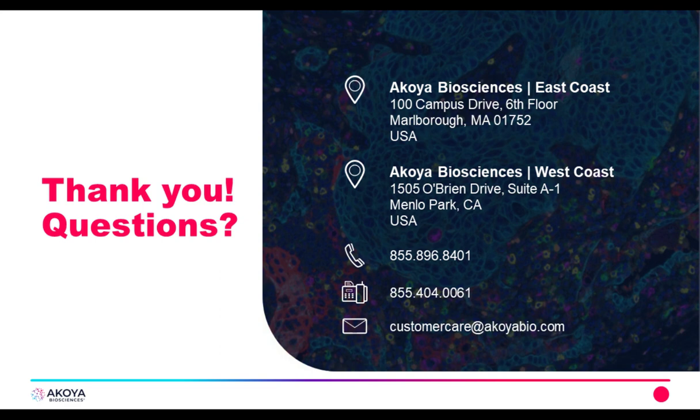It definitely is a situation where you want to have a conversation with the IT department or the infrastructure within your institution or company to make sure that you have the bandwidth to store these large image files, sometimes up to a gigabyte for just a single experiment. In the same way that sequencing data requires a lot of storage space and forethought and planning when you implement a new system, you just have to be ready for that influx of data.